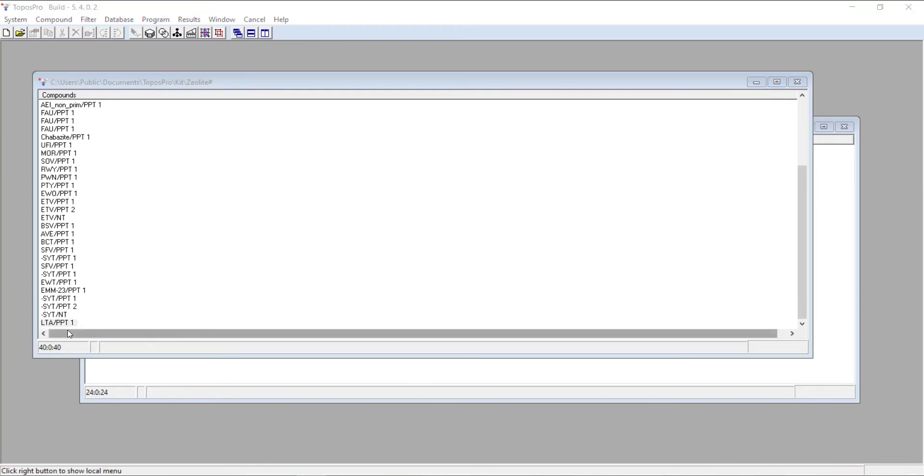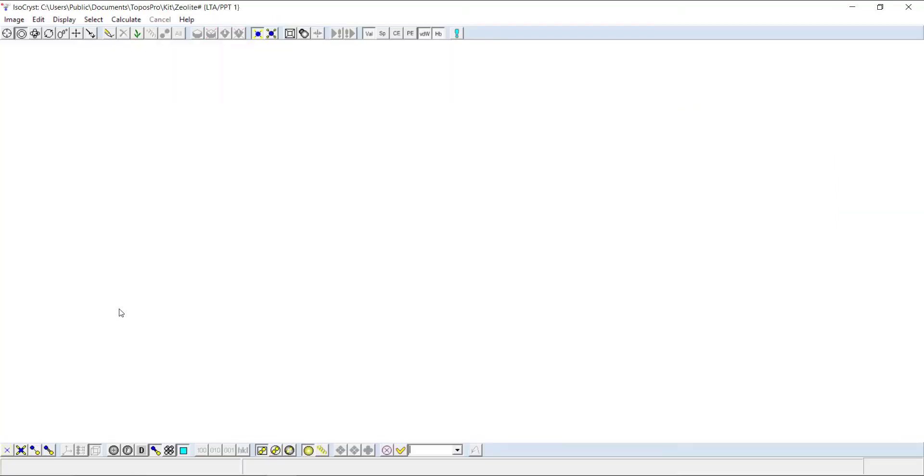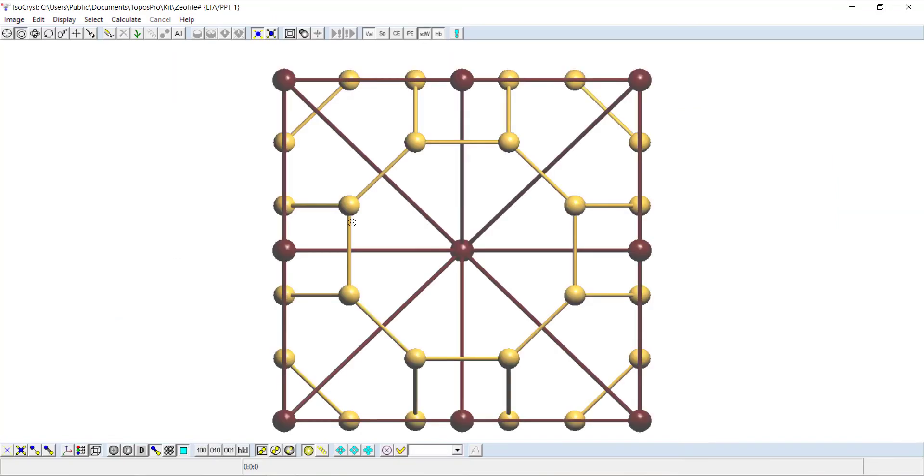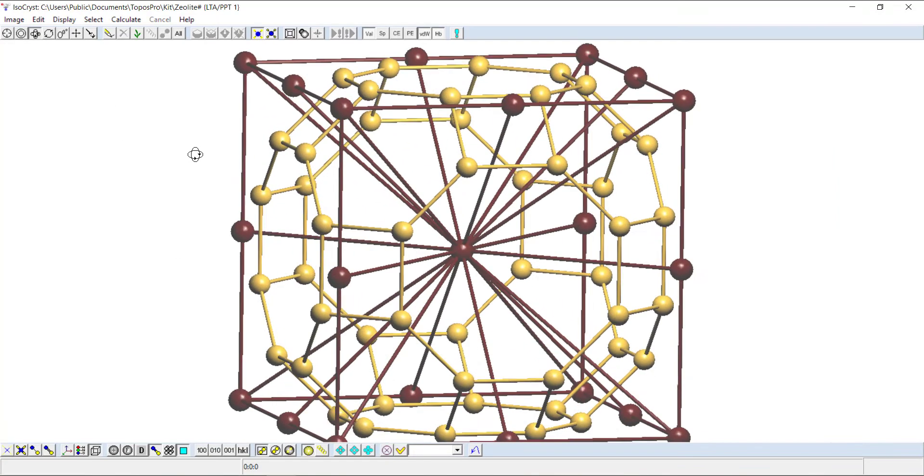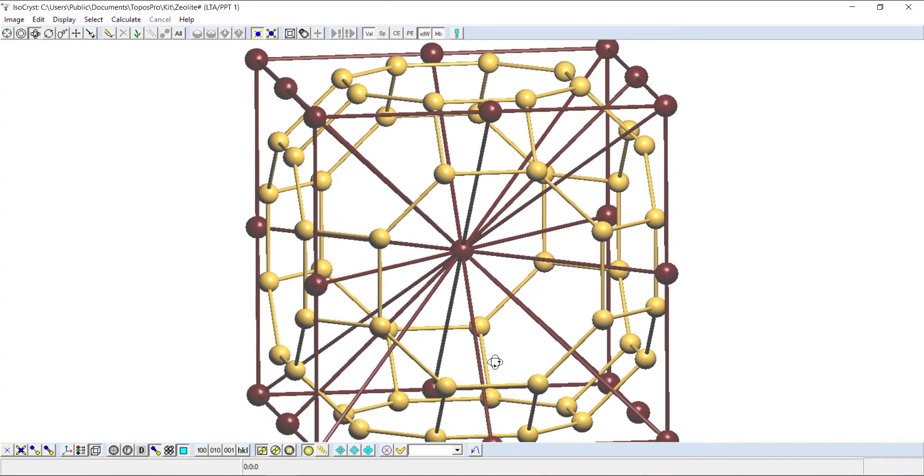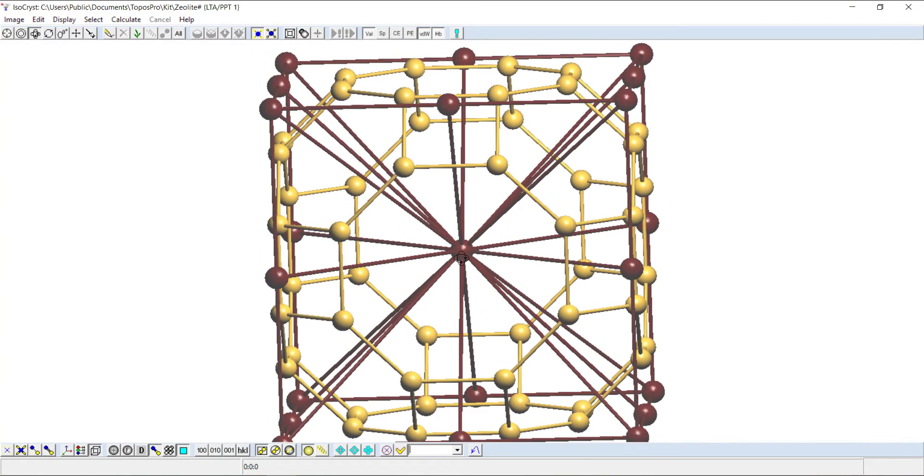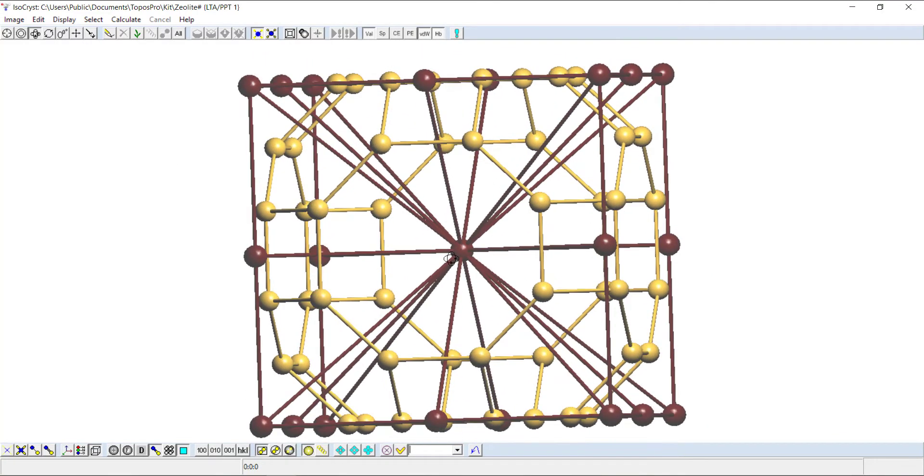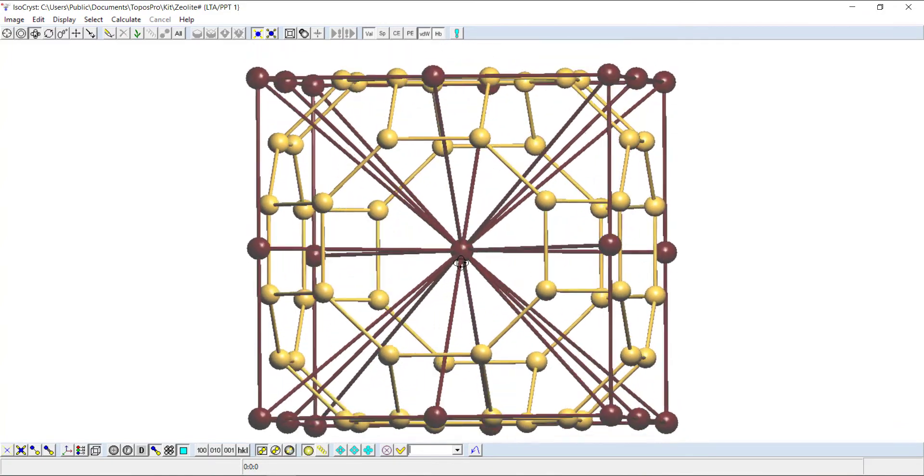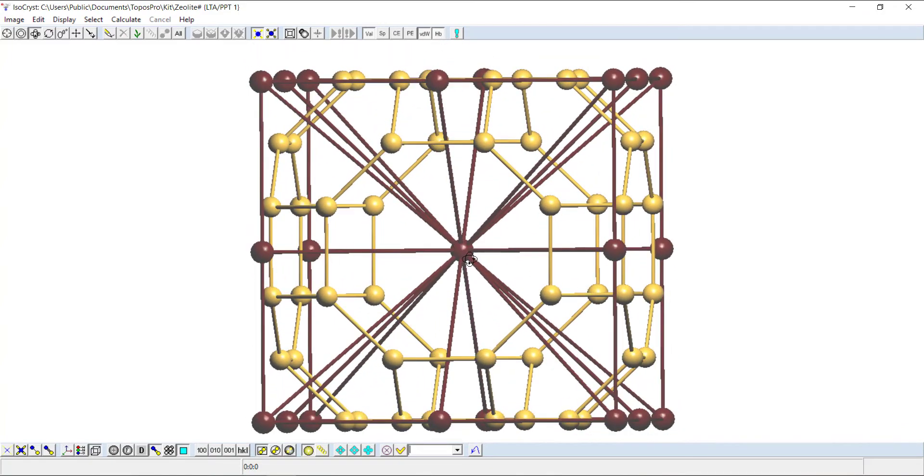Now that we've calculated the tiling for LTA, we can visualize the structure again and see that the dual net has been added. The dual net is the inverse of the tiling, so the center of each tile will have an atom placed at the center. This one uses some dummy atoms here.